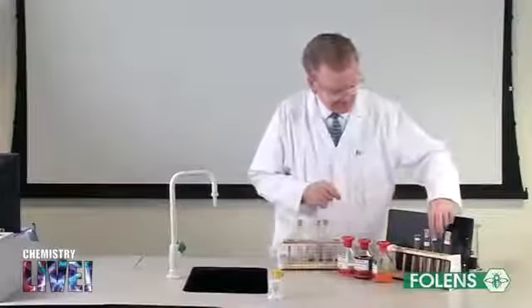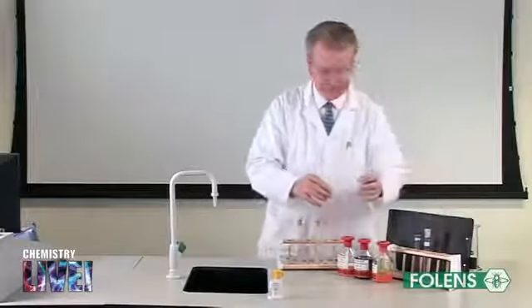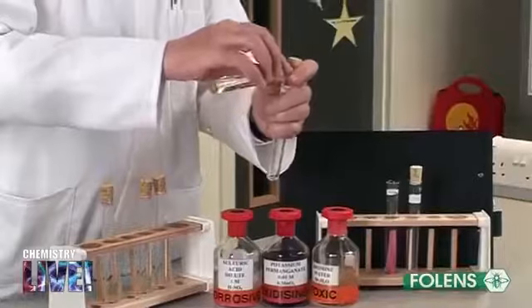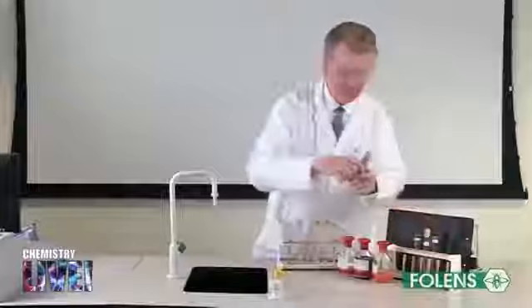Addition of bromine. As in the case of the preparation of ethene, bromine can be used to test for unsaturation. Add about 1/10 of a test tube of bromine water to a test tube of ethine. Replace the stopper and shake the test tube a few times.